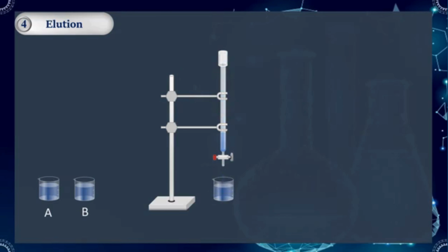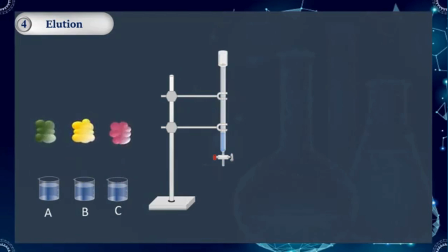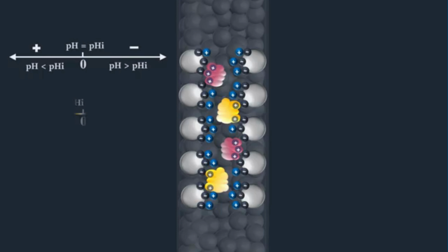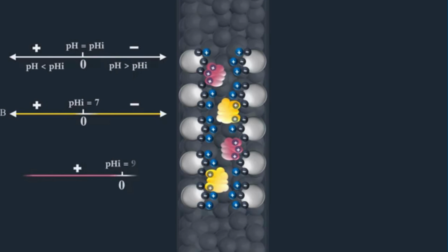Cleaning chemistry must be matched to resin chemistry. Depending on the resin and foulant, acid, caustic, reducing agents, salt solutions, or carefully selected surfactants may be used. Excessively aggressive treatment can hydrolyze or otherwise damage functional groups and shorten resin lifetime.